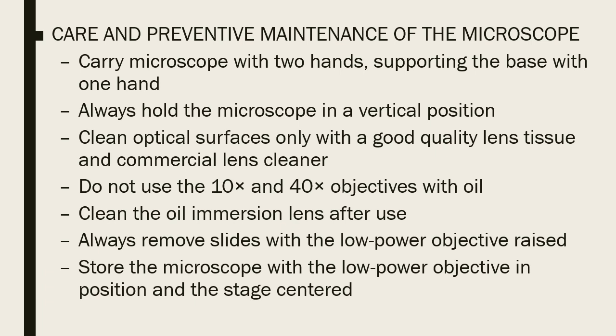When needed, always consult your manufacturer's manual as well. That is for your microscope.